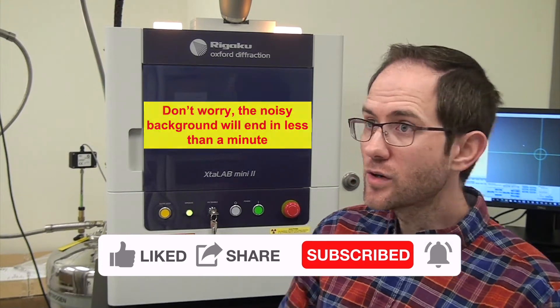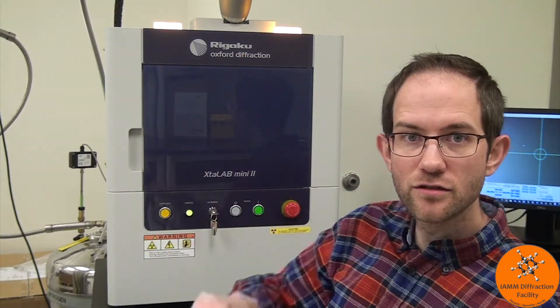In this video, I will introduce the Rigaku Crystal Lab Mini 2 single crystal diffractometer. More specifically, I will show you some of the hardware that's inside and then how to mount and orient a single crystal.